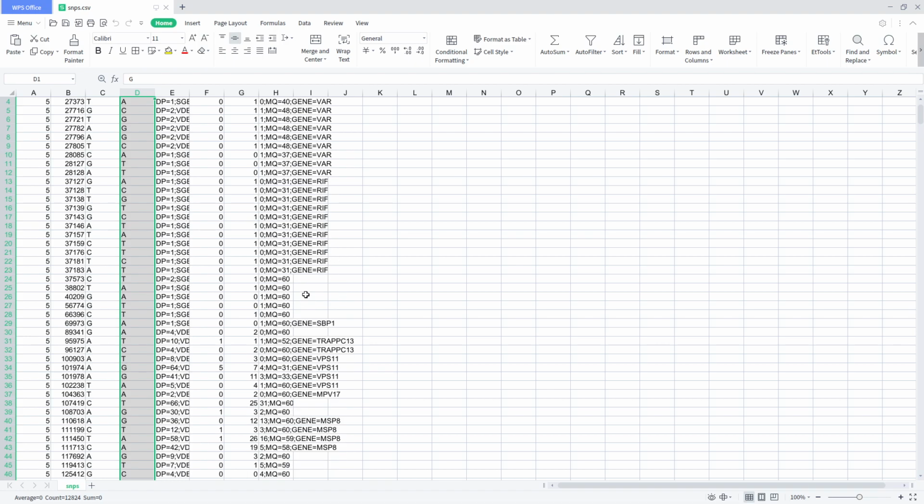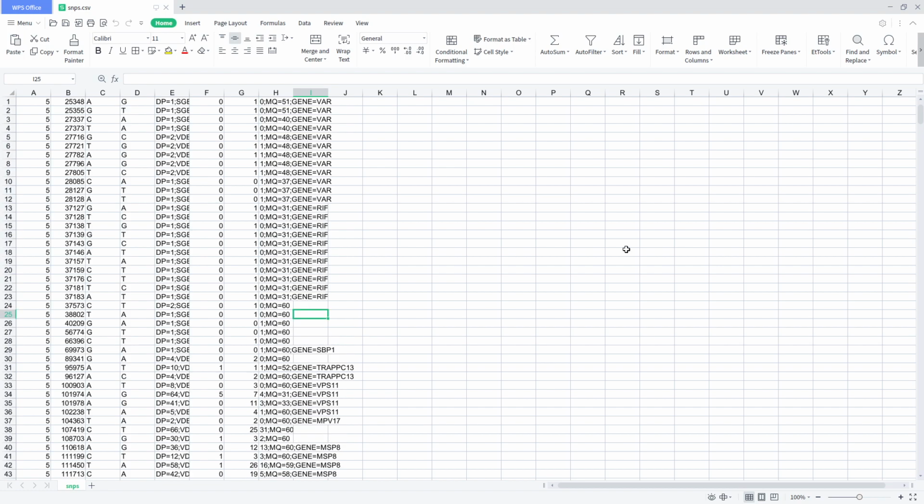Now, for regions where bcftools does not find information, you will see that they are blank. Okay, that's another thing you also have to take note of. So those that are blank, that means there was no information in the BED file that bcftools could use. All right, so that one, you are responsible for making sure whatever information is needed to be added, you place it in the BED file. All right, so this is how we do it. Okay, so that is a good thing.